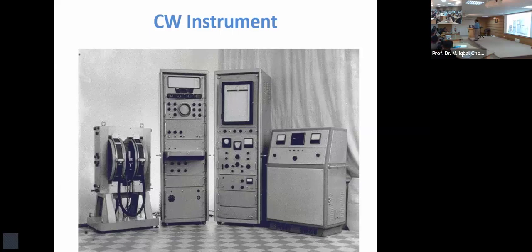Okay, so the question is, why precession frequency? Why do they not just remain static, aligned or opposed? Why do they have this weird movement like this? So this is the behavior of a tiny little magnet which is trying to survive in a large one.